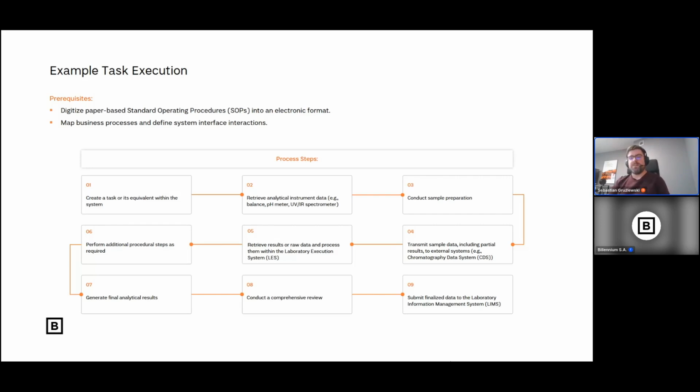So we need to define where we take this sample from. You may have a LIMS system already available in your system, you may not. Maybe you want to use some built-in function of your system, but you need to consider what happens if your LIMS system goes down, how to cope with that, because lab work just cannot stop.